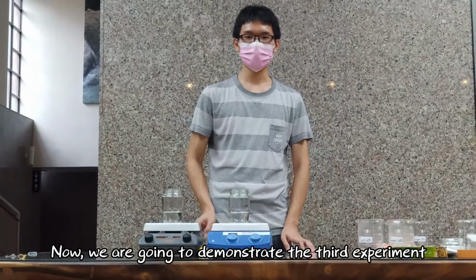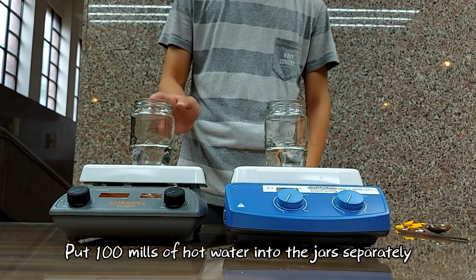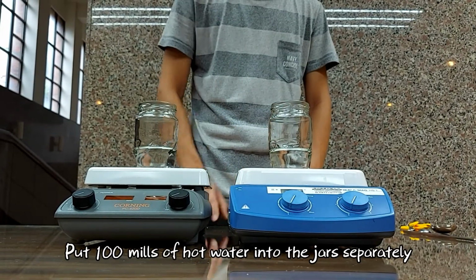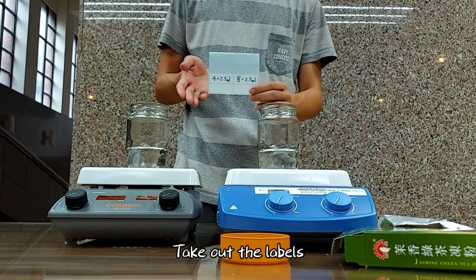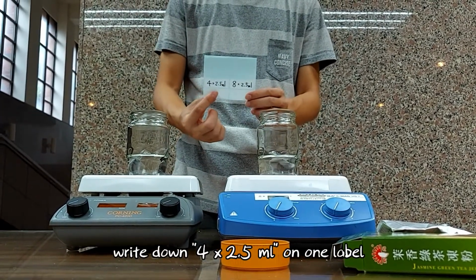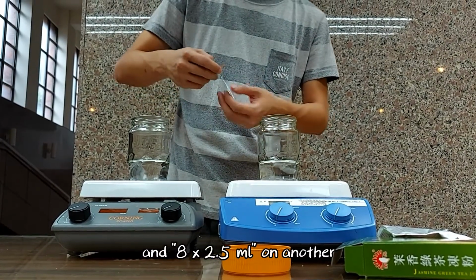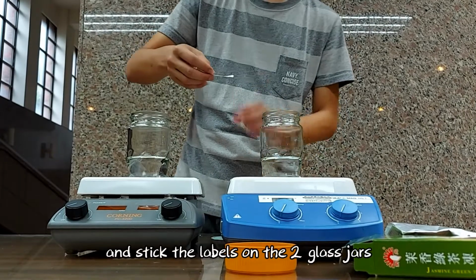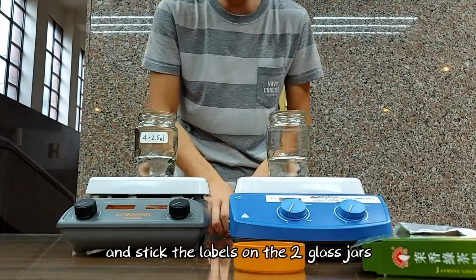Now, we are going to demonstrate the third experiment. Put 100 ml of hot water into each jar separately. Take out the labels. Write down 4 by 2.5 ml on one label and 8 by 2.5 ml on another, and stick the labels on the two glass jars.